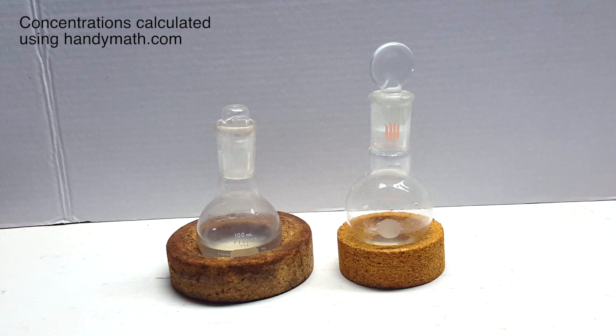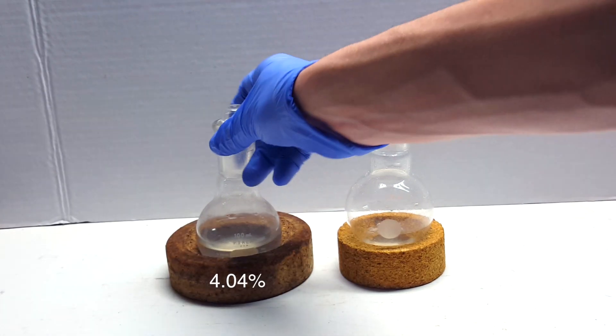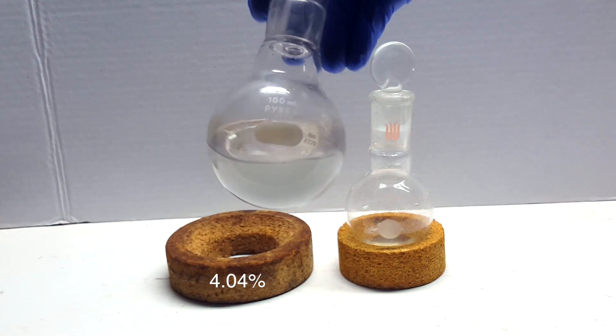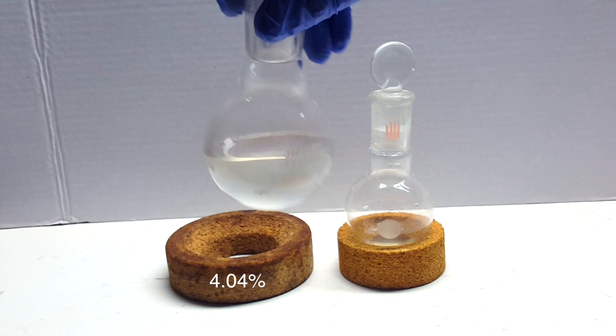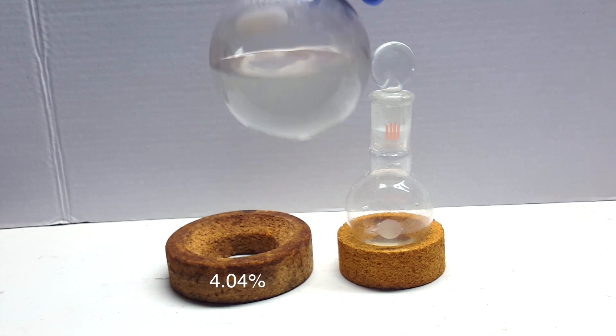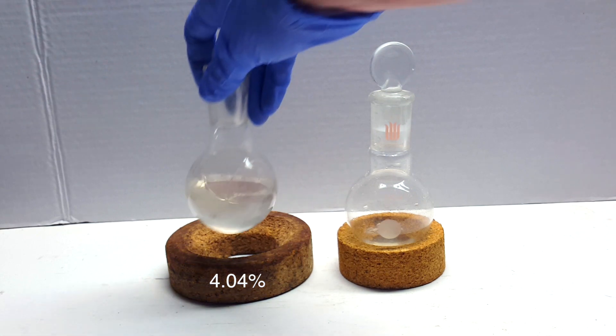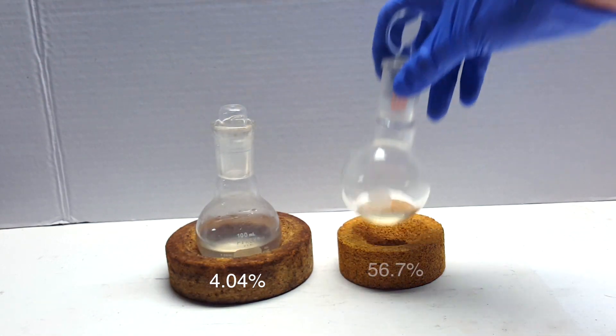I found the density of the second two solutions just like in the previous video, and plugged the values with the temperatures into the same website. The solution on the left had a concentration of 4.04% phosphoric acid. This value is actually less than the starting dilute phosphoric acid added to this batch. While the first solution was disappointing, the second had a concentration of 56.7%.